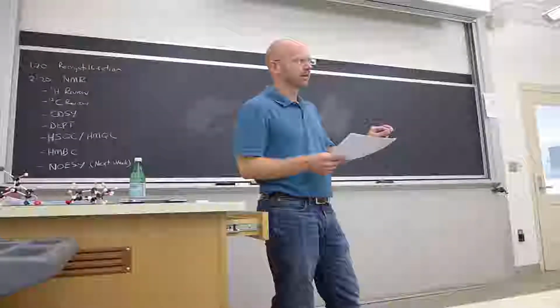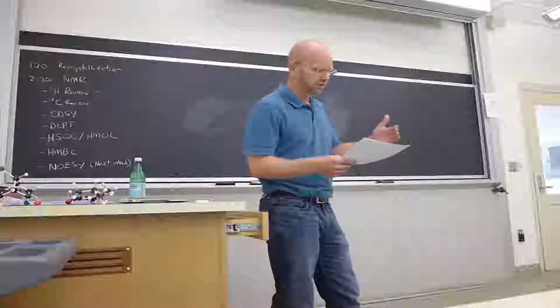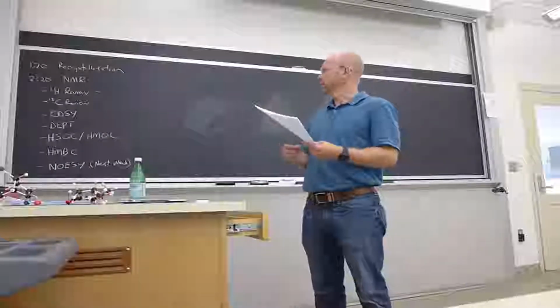Carbon-13 NMR. Have you been exposed to carbon-13 NMR? Okay, good. So let's start with that, and then we'll move into these higher level experiments.